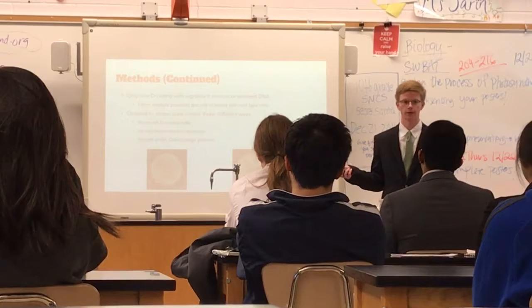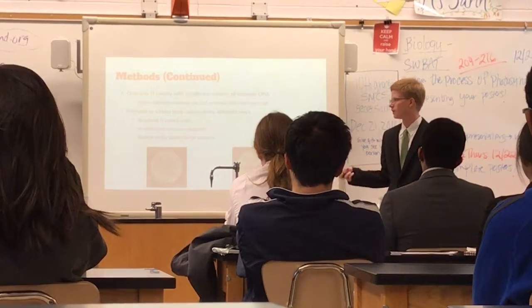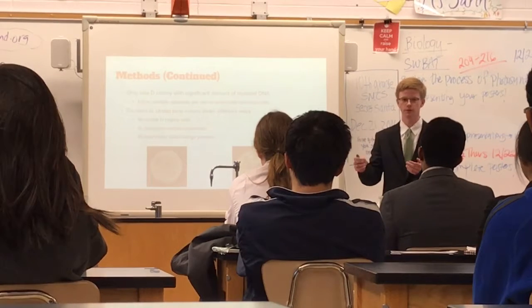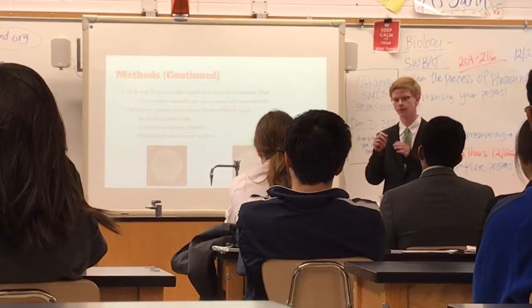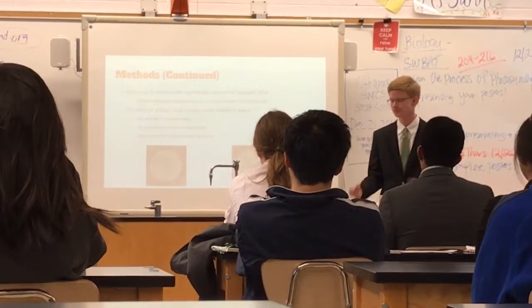So I went about 3 ways to try to get a pure colony of E. coli that would have my mutation. The first one was to restreak the D colony cells, which is just taking a toothpick to the cells and streaking them out on the plate again. It separates the E. coli, lets them grow, and further isolates each cell from each other.